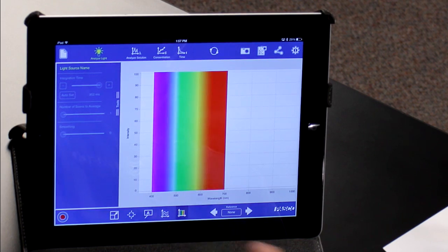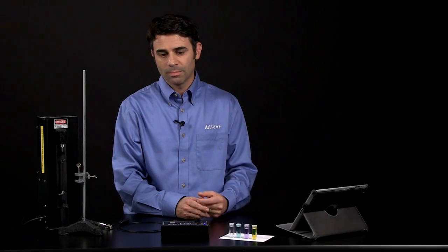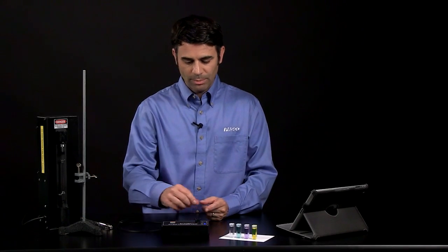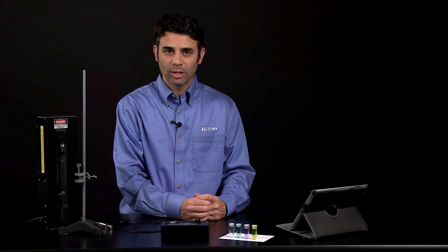Once I start the software, the spectrometry software on the iPad, then it'll also ask me to pair the spectrometer. I'll do that the first time using the ID number on the back. After I do that the first time, it'll recognize the spectrometer and it'll pair by itself.